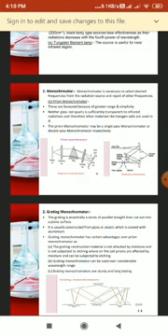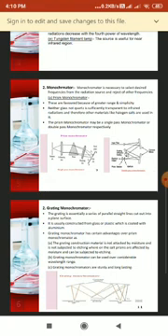In both single and double pass monochromators, sodium chloride, meaning rock salt, prisms are employed for the entire region from 4000 to 650 per centimeter. Prisms of lithium fluoride and calcium fluoride give more resolution in the region where the significant stretching vibrations are located.